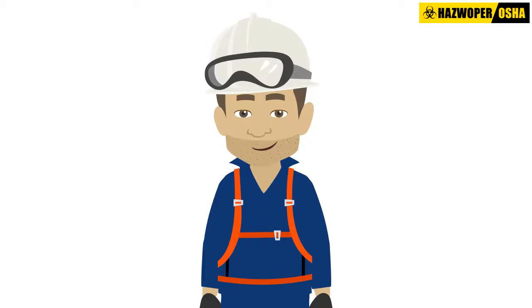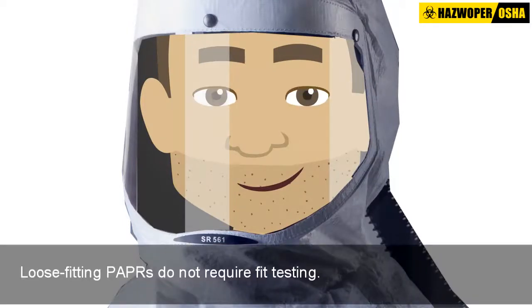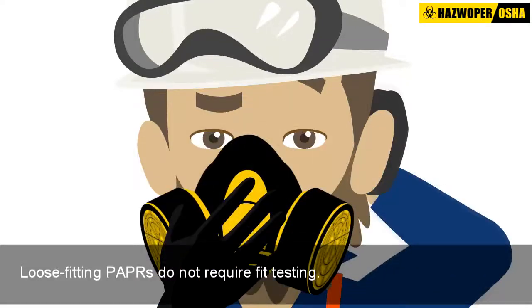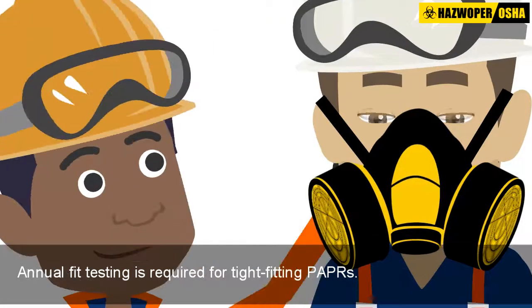A PAPR may have a tight-fitting half or full facepiece, or a loose-fitting facepiece, hood, or helmet. Loose-fitting PAPRs do not require fit testing and may be an alternative for users who have facial hair or are otherwise not able to pass a fit test with a tight-fitting respirator. Annual fit testing is required for tight-fitting PAPRs.